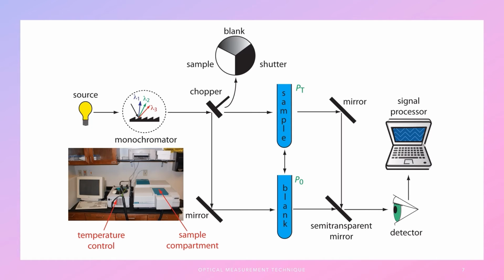The simplicity, accuracy and cost effectiveness contribute to its popularity in areas such as pharmaceuticals, life science, foods, environmental studies, forensics and mineralogy. Today, it is difficult to imagine a laboratory that is not equipped with a UV-Vis spectrophotometer.